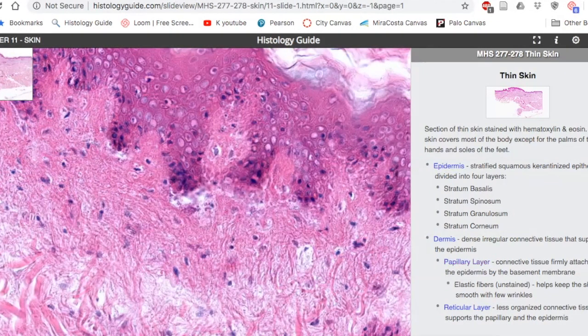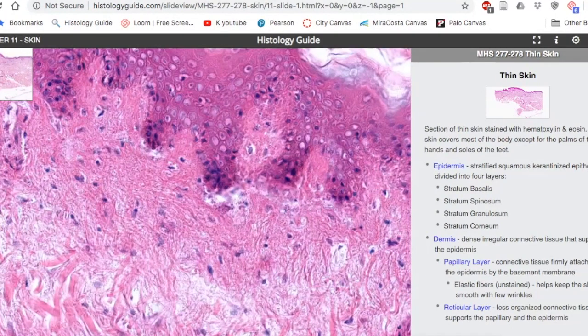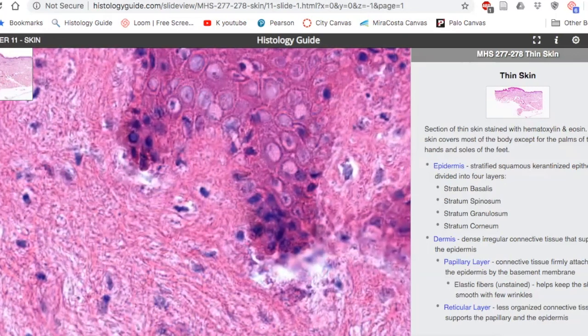okay, this is something, and this is something different, obviously. Where is the areolar tissue? With these samples, first off, epithelial is this down here, and hopefully soon it will be obvious to you that this is not epithelial tissue. You see a cell here, cell here, cell here, cell here. These cells are widely spaced apart. You have a lot of stuff, junk, in between them. This must be connective tissue. These dark purple dots are the actual nuclei of the cells.